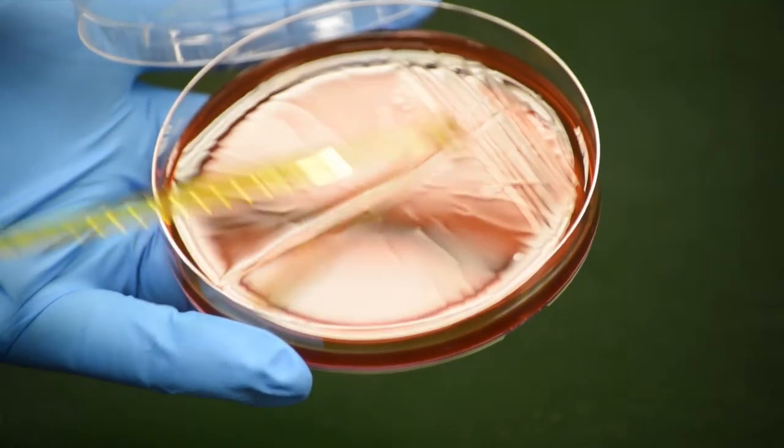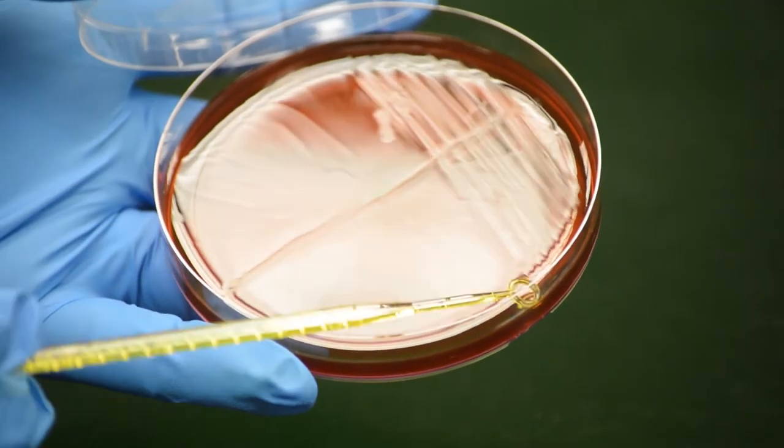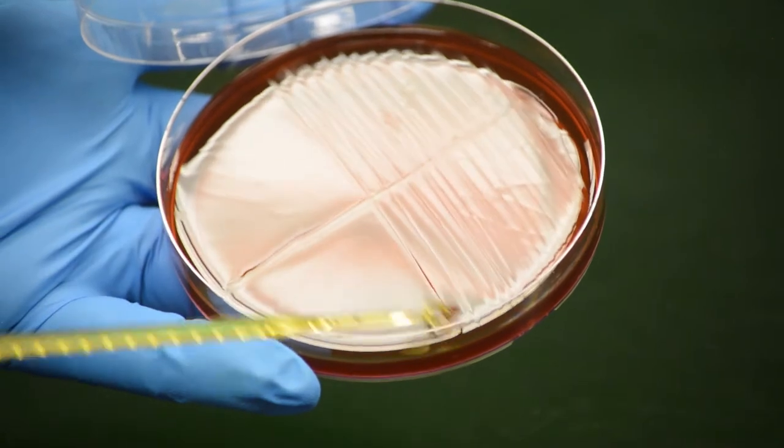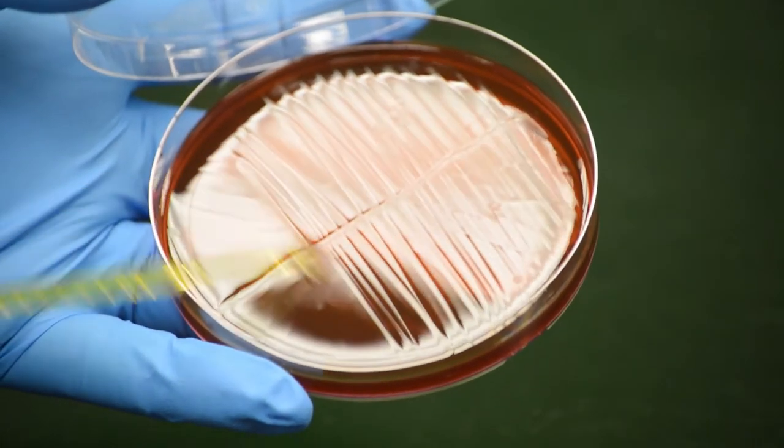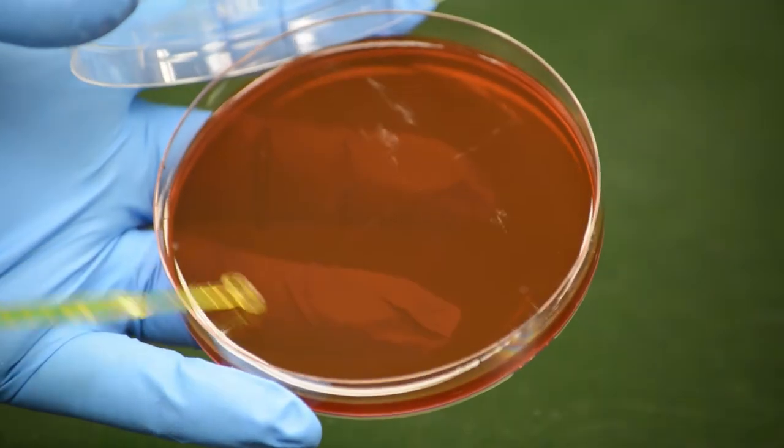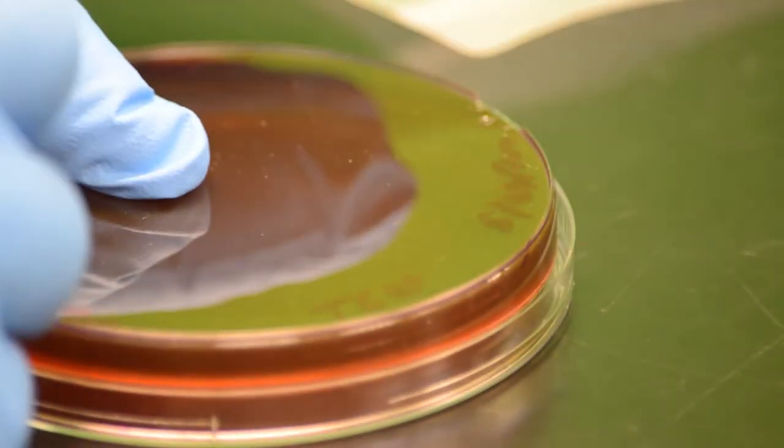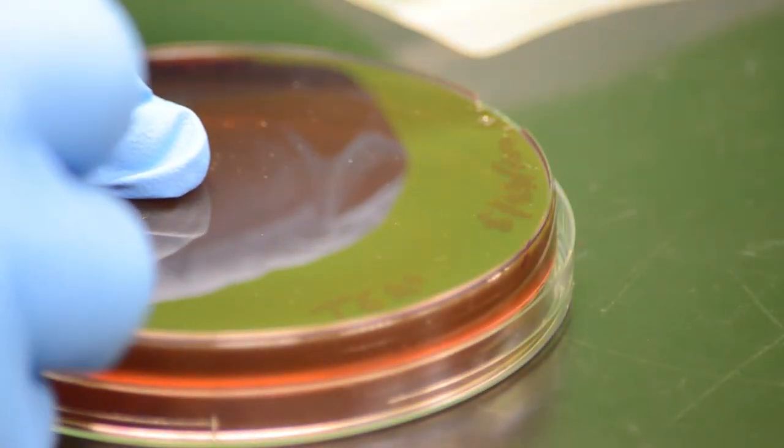From the end of the vertical streak, streak from side to side moving down the streak about 15 times. Follow the pattern shown in the video. Label and seal the inoculated petri plate, then store the plate in an inverted position.